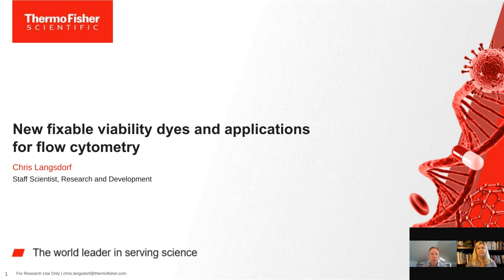But when your cell model requires it, it's possible not to wash. And so in that case, the spillover to adjacent channels should remain largely unchanged.